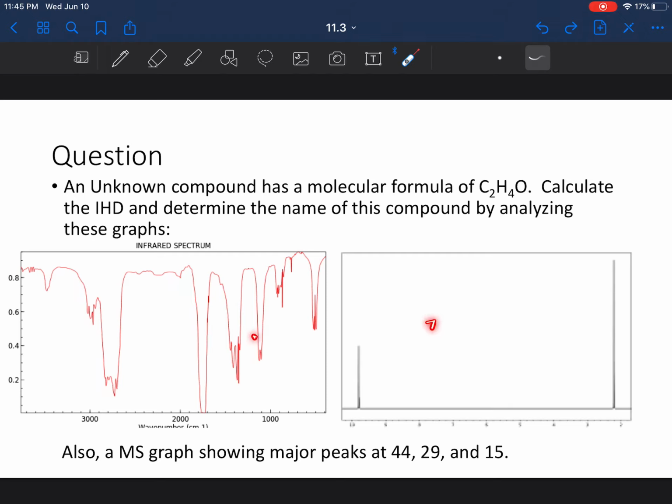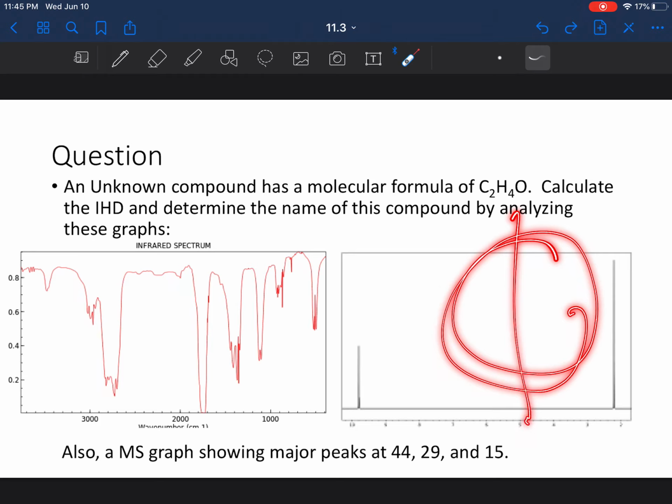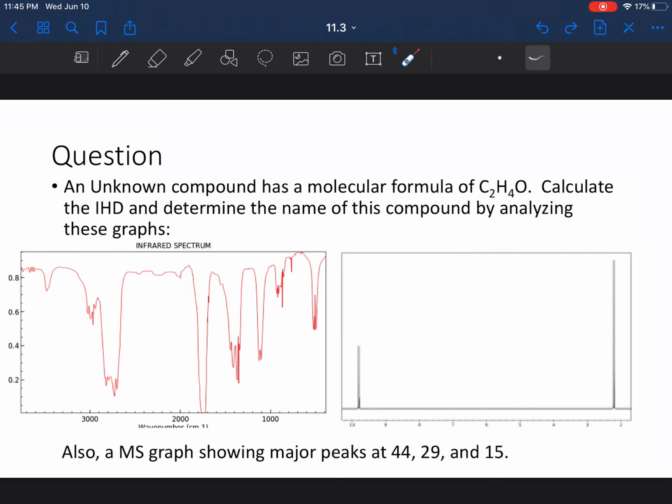If I were to make a prediction out of these two and draw that prediction and fragment it, then of course these should make sense. And counting the number of double bonds also makes sense with this. Or maybe a ring. I doubt it's going to be a ring. This can never be a ring. Alright, so I'll leave that up to you.